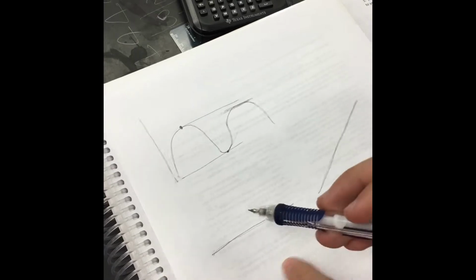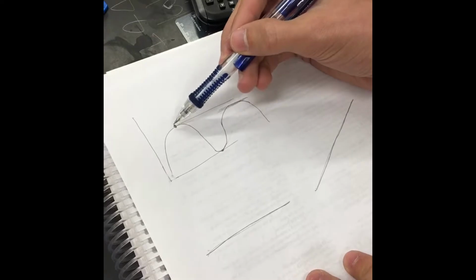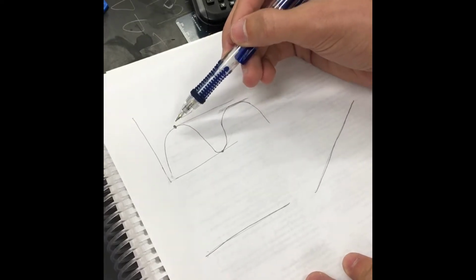So our graph would end up looking like this for all our measured concentrations. The slope would be close to 0, so there would be almost no measurable difference. However, if we pick the point with the highest absorbance, the lambda max, then we would get a defined linear expression, which would give us clear differences in the concentration, allowing us to find different concentrations.